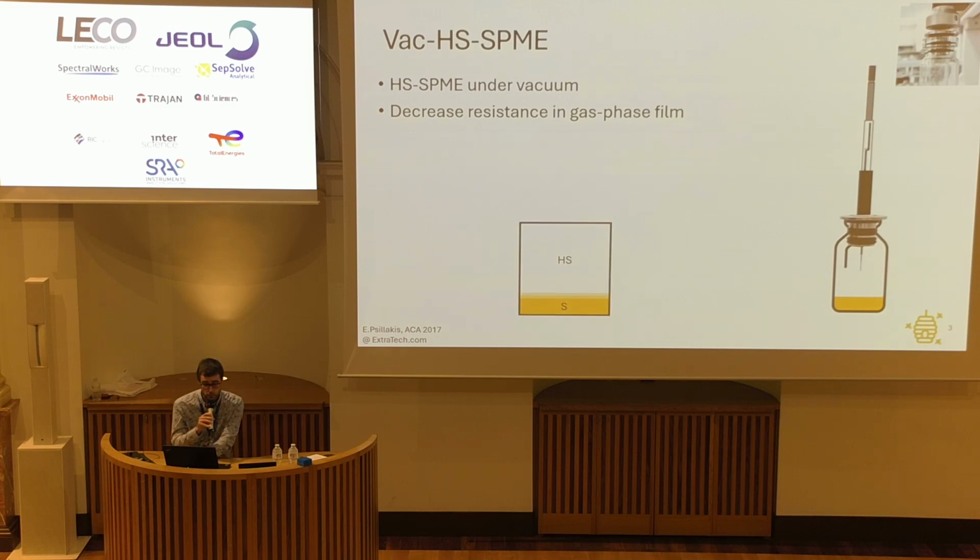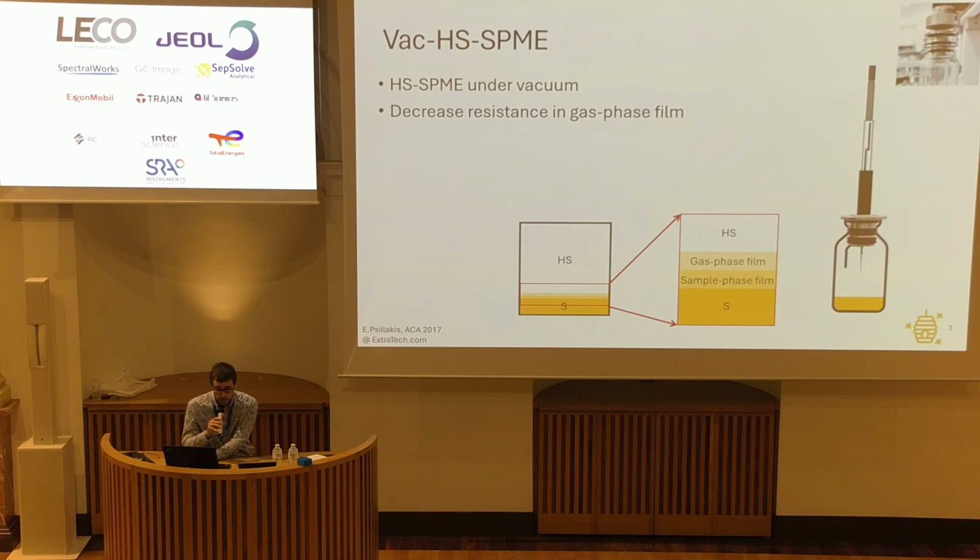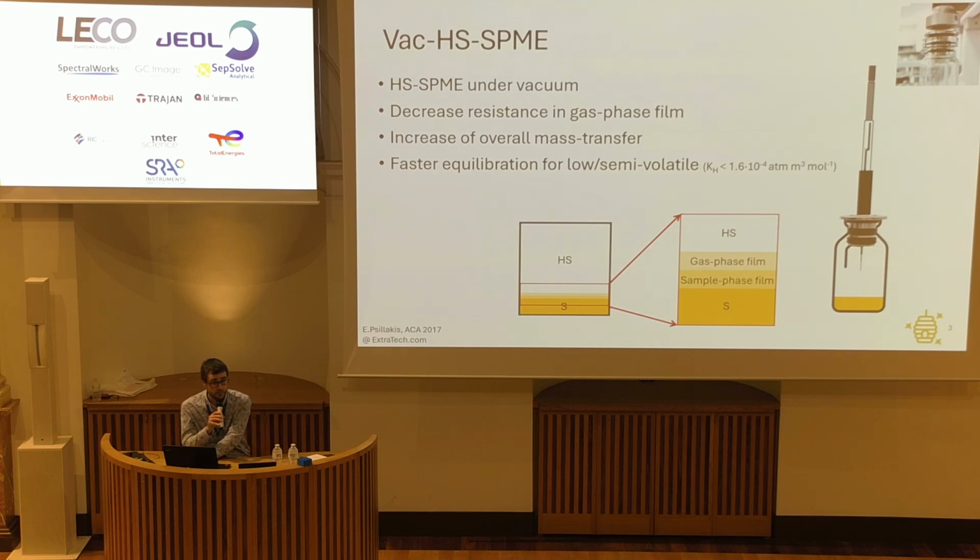If we have a closer look at the interface between sample and headspace, there are two phases, and the vacuum will decrease the resistance to the mass transfer in the upper part close to the headspace, which overall will increase the mass transfer from the sample into the headspace and also shorten the equilibration time for the low and semi-volatile compounds. And since HMF is considered a semi-volatile compound, we are expecting that the use of vacuum will be beneficial.